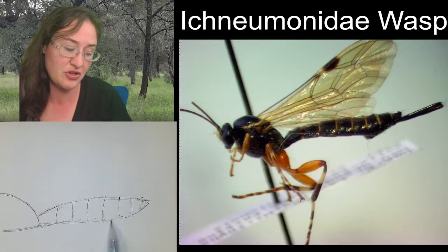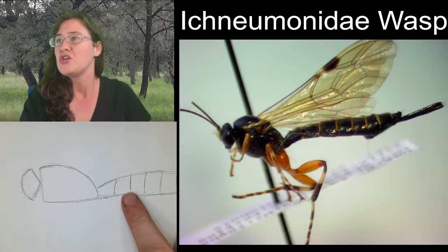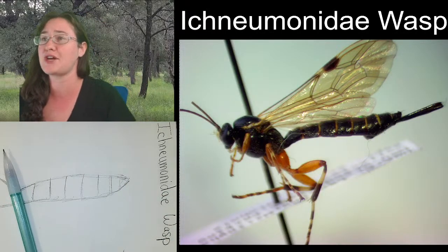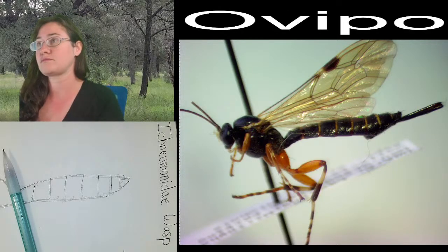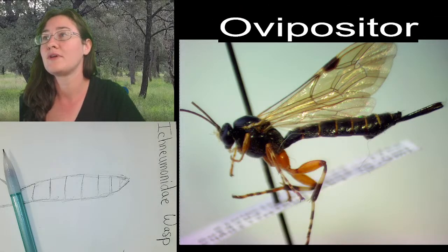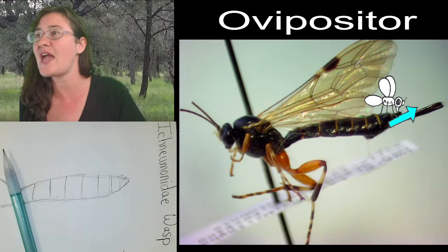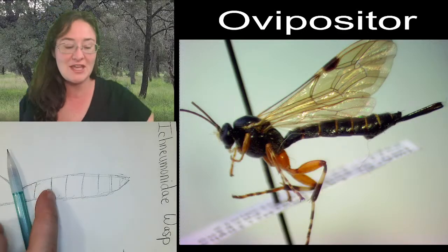And this is also going to change and be modified, but I want to get us a basic start. So we've got these long, thin, 8 abdominal segments, and then we have what we call the ovipositor, spelled this way. We have the ovipositor, and that is way back here. This is an egg-laying device, which means that our specimen today is female.